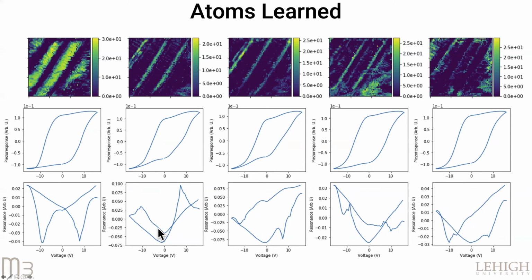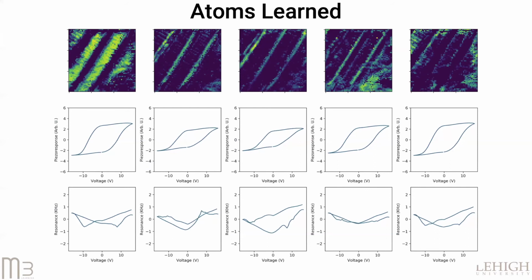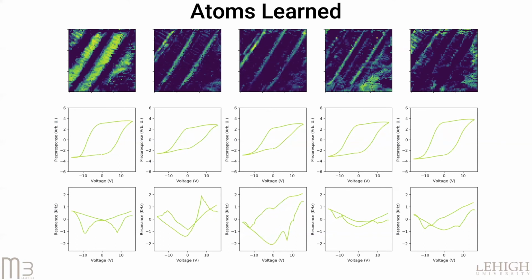Moreover, because the mean was extracted from this data before the dictionary learning was fit, the absolute position of these spectra are hard to relate back to the physics, even though they have physical meaning. So we can again use the dictionary learning as a generator and look how the individual spectra change as we change the alpha parameter. As you can see, the first 2 parameters kind of stay as they are, with the second parameter showing some increase in the magnitude of this 2-step, 3-state ferroelastic switching process. But the other parameters really don't change, and it's very hard to understand what's going on in the different parameters outside of the first 2.